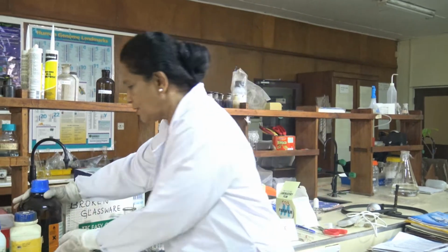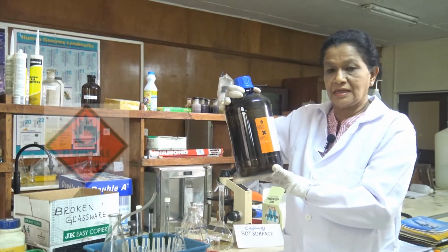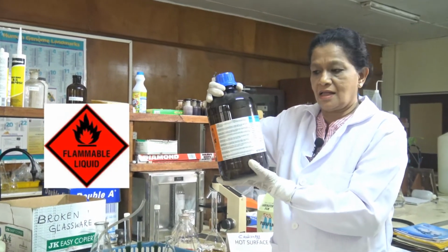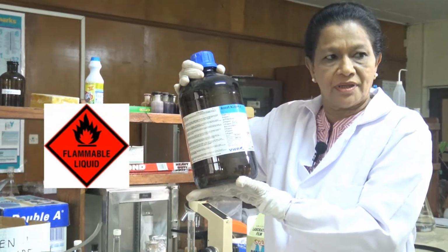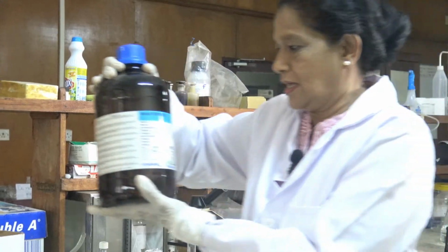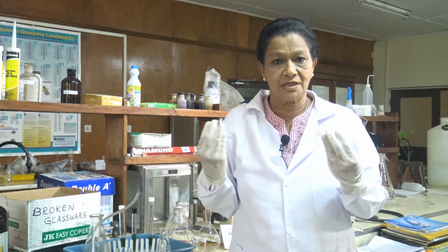Finally, flammable liquids. Examples for highly flammable liquids are ethanol, methanol, dimethyl formamides. These can cause wounds and excessive exposure to the vapor of these liquids may cause dizziness.